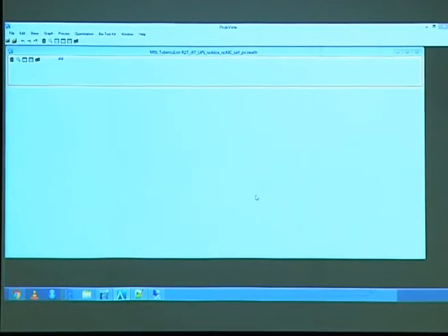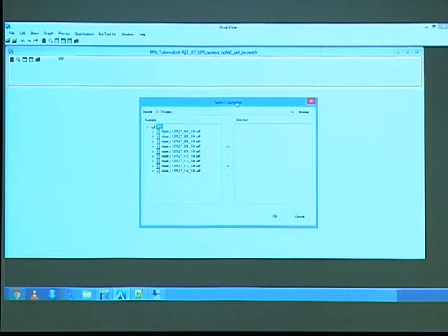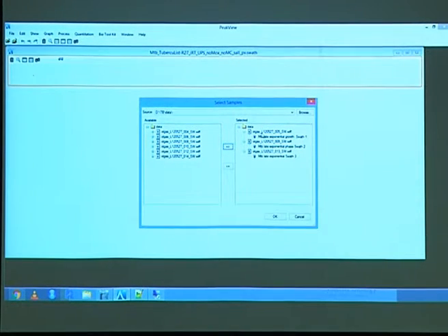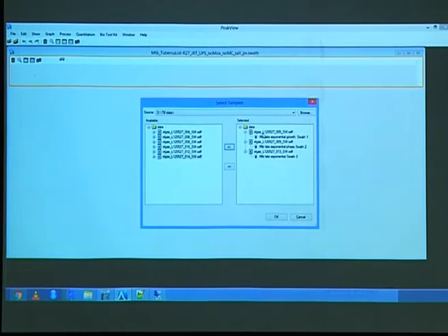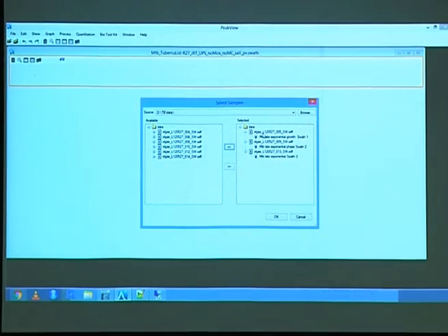Done. Good. Now the second thing you need is the SWATH files. So I'm going to select them. We're going to look at all of them later, but just for this purpose, you can select them, and here you see, you can select them and transport them over there. You can go to multiple folders and select them, no matter how it's organized. You should know the more you load, the longer it will take.